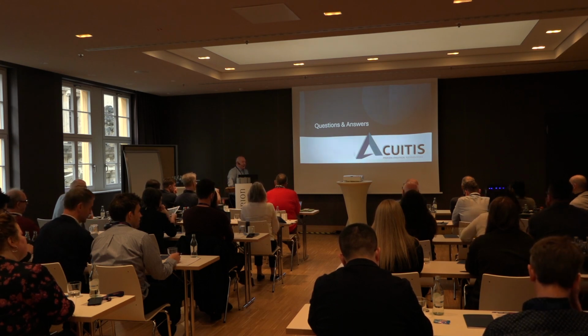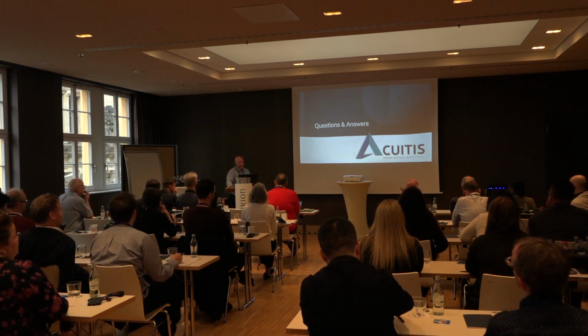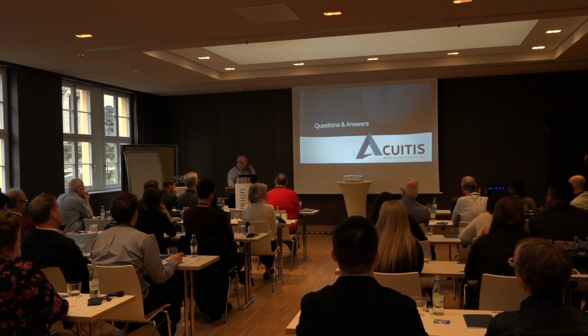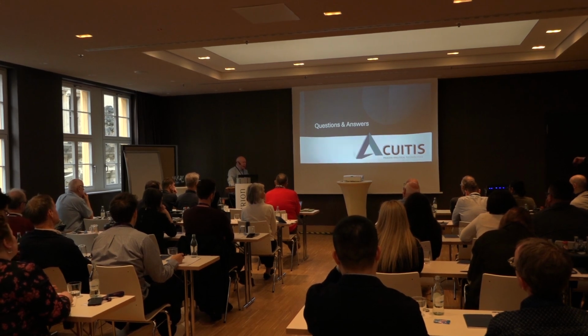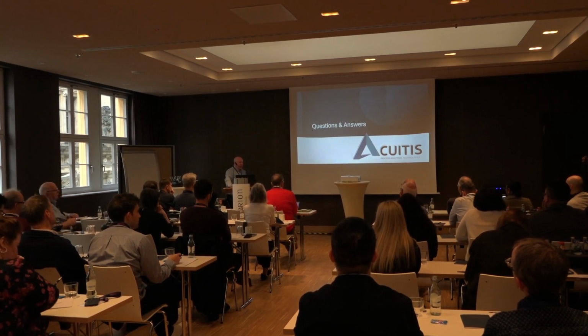The ideal really is to strive... It's a double-edged sword, really, Owen. Ideally, you want to strive towards unit dose equivalence. So you want to show, if this was a tablet or a capsule, this would be the variability from dosage unit to dosage unit. But there is important micro information in there as well. And it's important not to throw the baby out with the bathwater, really.